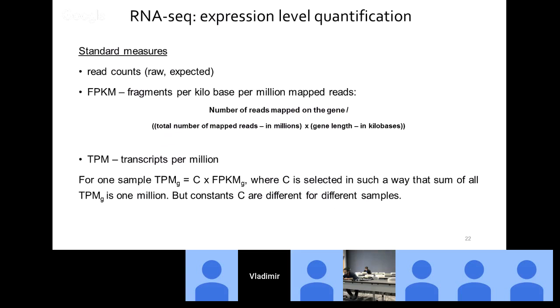So if we want to perform scaling that takes this fact into consideration, we should use not just the number of reads mapped on a gene, but the number of reads scaled by the gene length. So standardly, here gene length is measured in kilobases.